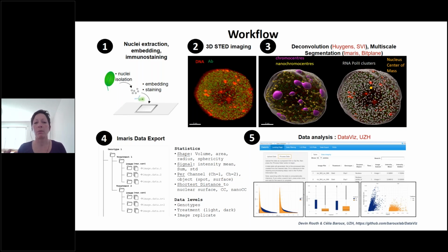As soon as you have a bit of contrast in the signal, you will be able to segment it and make a proxy, and determine a fraction of your signal to be considered as a discrete region.